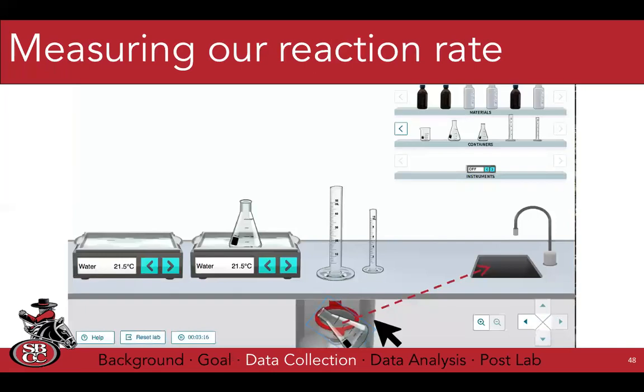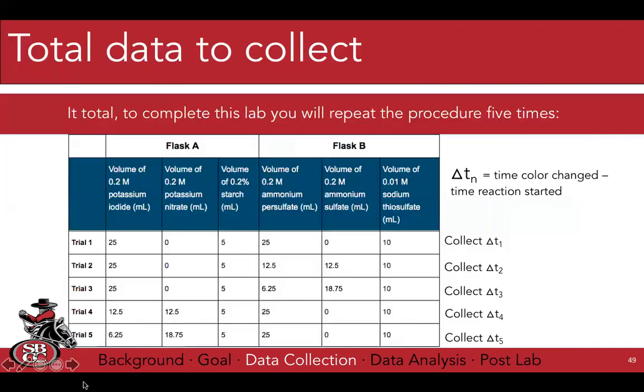And then of course you're going to be pouring your waste out. This sounds like a silly thing, but you're going to be using a lot of flasks today. So make sure you remember to pour the waste out and put it in the sink, because you will definitely not have enough room to do all of these runs if you're not doing this every time.